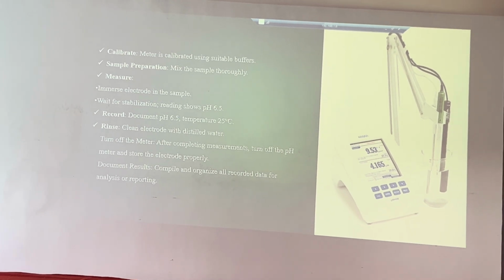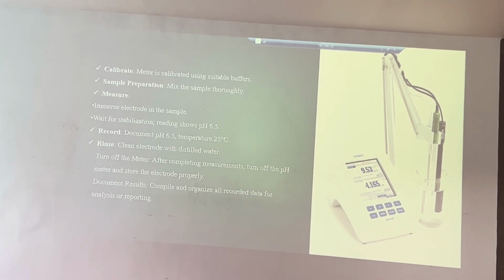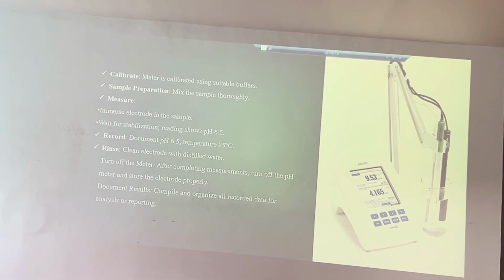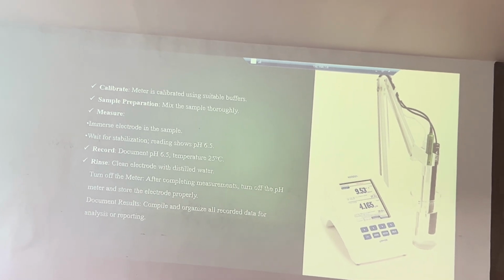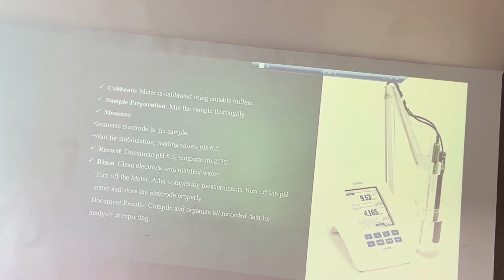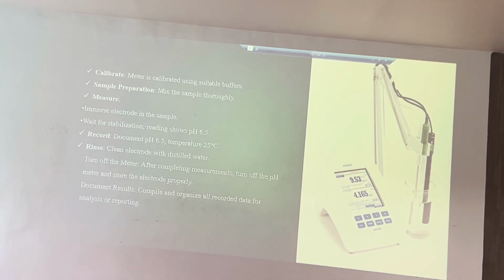At the same time, whenever you are doing daily calibration, we do a 5-point daily calibration. Whatever process you are using should be hazy free, clean and neat. And always store your electrode in which solution? 3 molar KCl solution. Okay. Next.